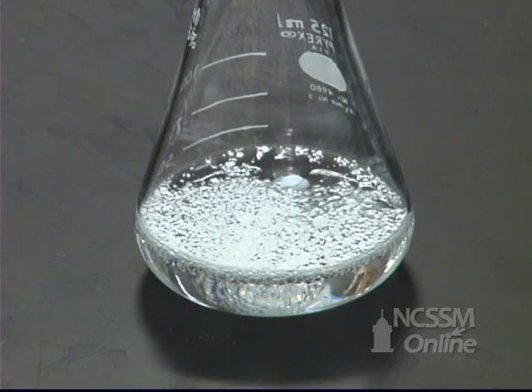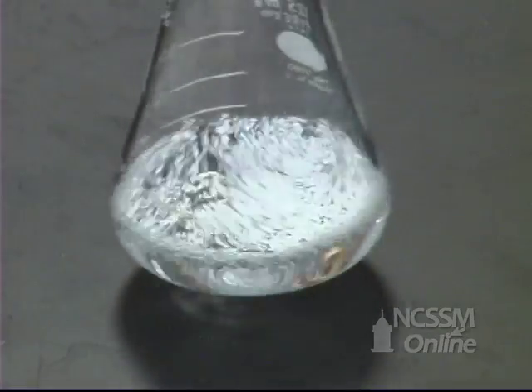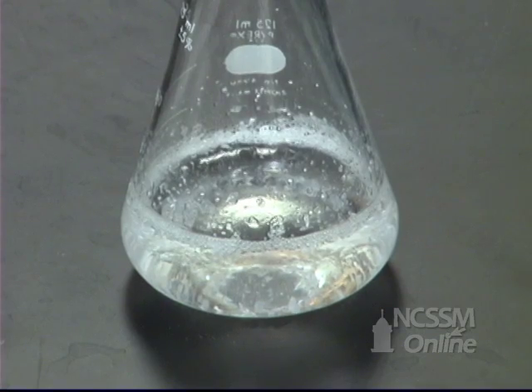We will need to heat the sample in order to get the reaction to go to completion. We will be left with some protein at the end, which held the calcium carbonate together. We've heated the sample to drive off the carbon dioxide and to get the sample to completely react. We have a small amount of protein left floating in the flask.